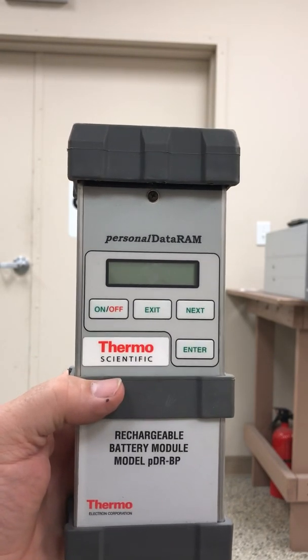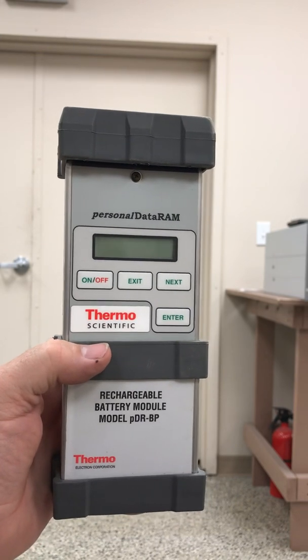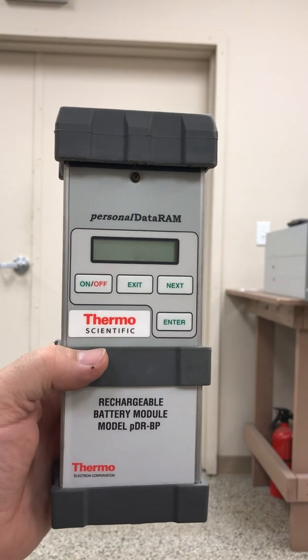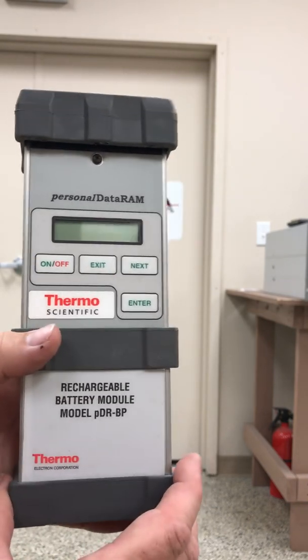Hi everyone, Jim with CDNOVA again and today we're looking at the Thermo Scientific PDR-1000 particulate monitor. This is a personal particulate monitor, very portable, very easy to carry around.